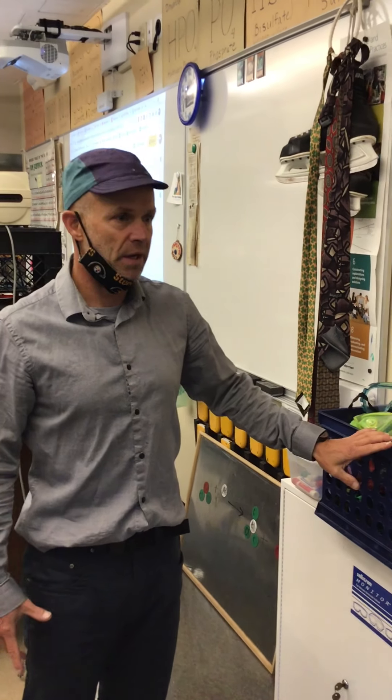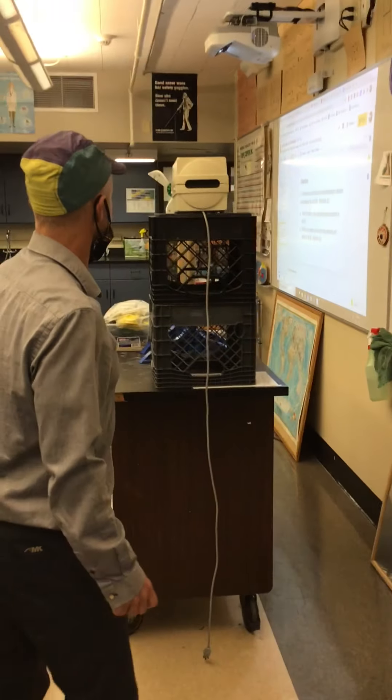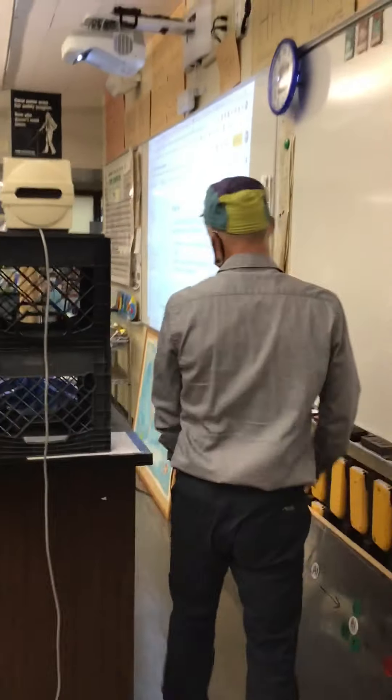The safety glasses, of course, are another safety feature of the lab. You're asked to wear these all the time if you are working in lab.